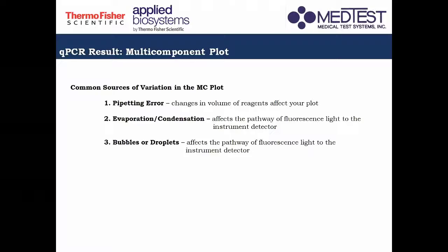So paano? We can avoid it by using appropriate containers, or the sample plates that we would want to use should be appropriate. And then we would also want that the PCR conditions that we are using in a qPCR instrument should always be appropriate also. No? Too much of the temperature will cause your plot to be pangit. Ganon.